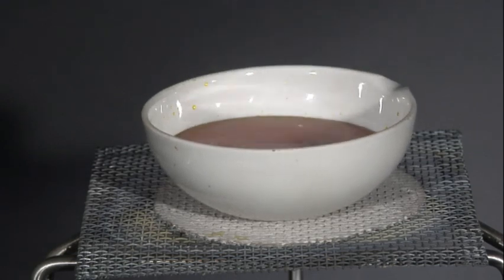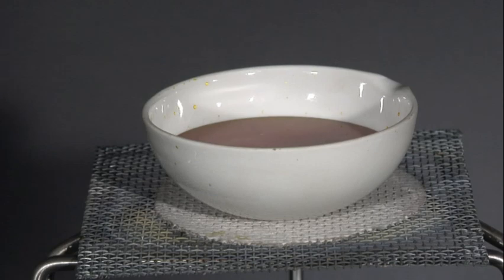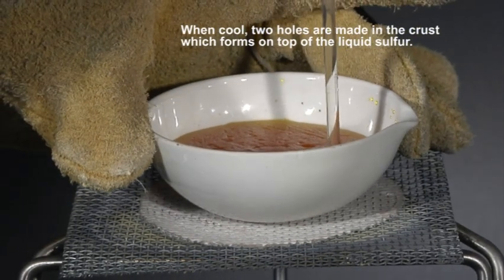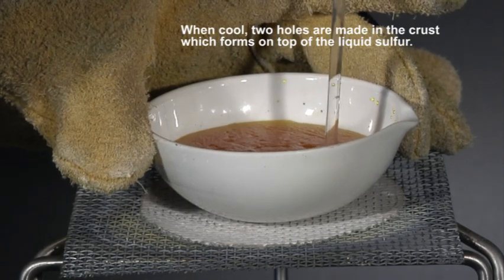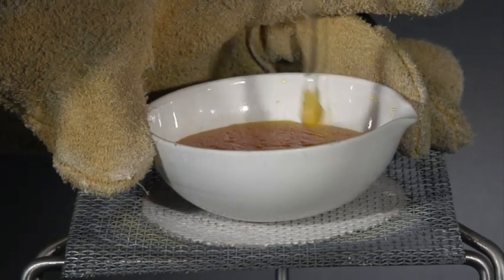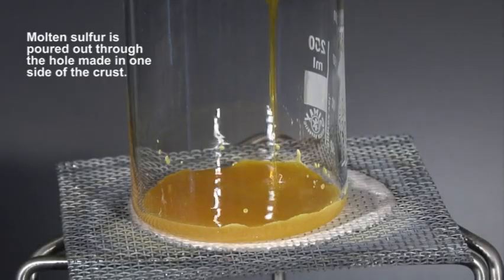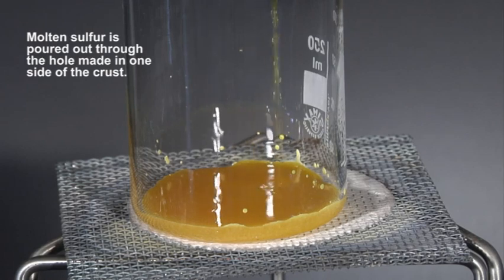The sulphur is melted carefully and then allowed to cool. Once a solid crust has formed, the molten liquid inside is poured out through small holes that are made in the crust.